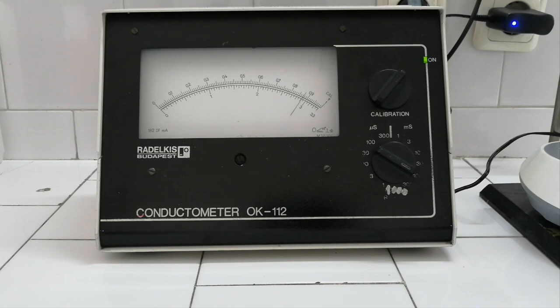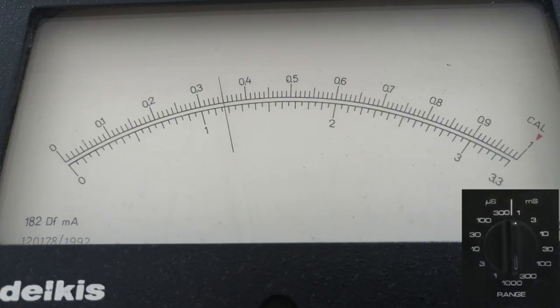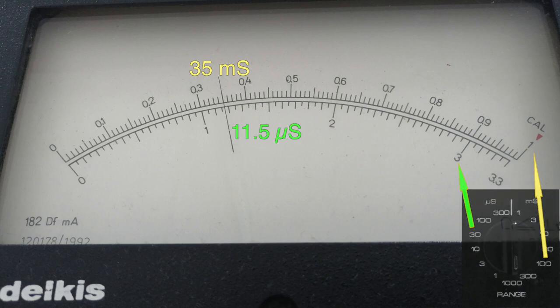If the measuring range starts with digit 3, you will read the conductance on the lower scale, the maximum value being either 3, 30 or 300. For example, in this case, if the measuring range would be 100 millisiemens, the value of electrical conductance would be 35 millisiemens. Instead, if the measuring range would be 30 microsiemens, at the same position of the indicator, we would read a conductance value of 11.5 microsiemens.